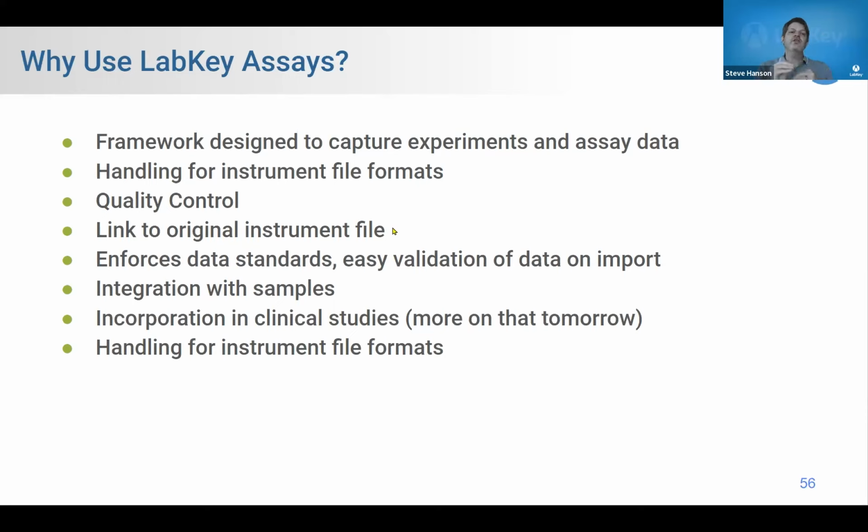We also, in general, this is universally true, LabKey enforces data standards and does validation on data import. So you end up with clean data. It's not messy data. We also offer integration with samples, integration with clinical data. And I've got a little duplicate here. And handling for instrument file formats.